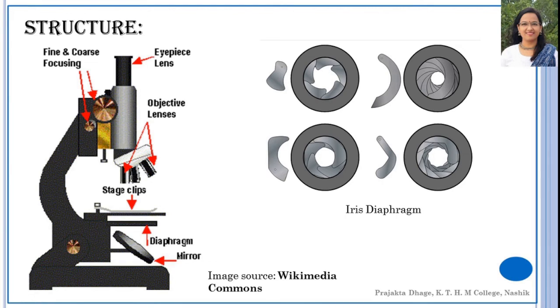The tube has an ocular or eyepiece of specific magnification, which can be changed for lower or higher magnification. That is, you can use a 5x eyepiece, 10x eyepiece or 15x eyepiece. Eyepieces with a pointer are also available.